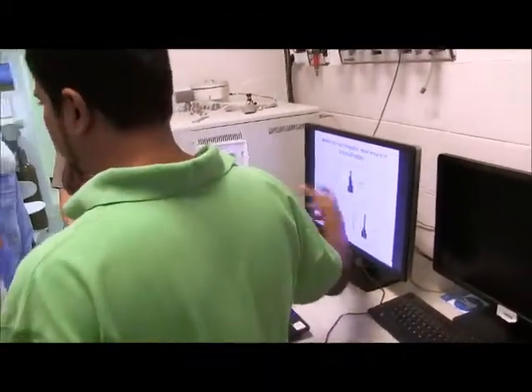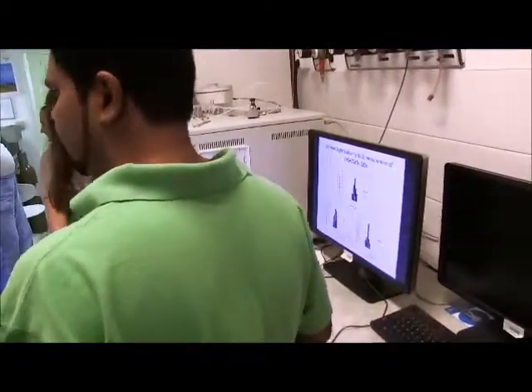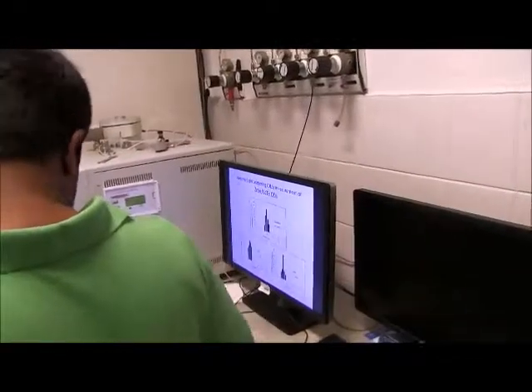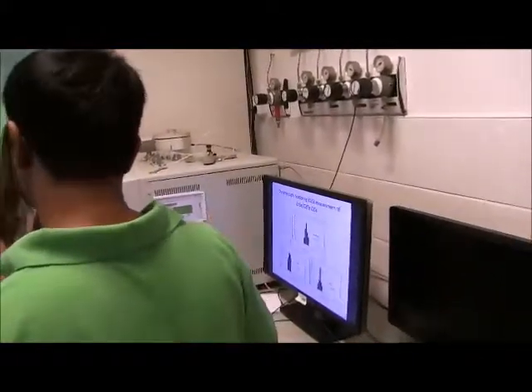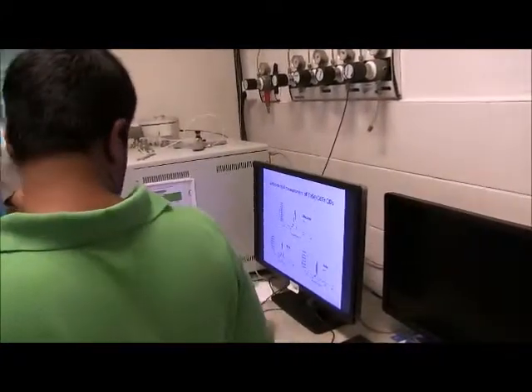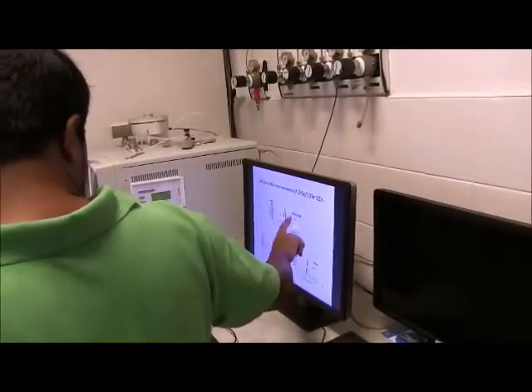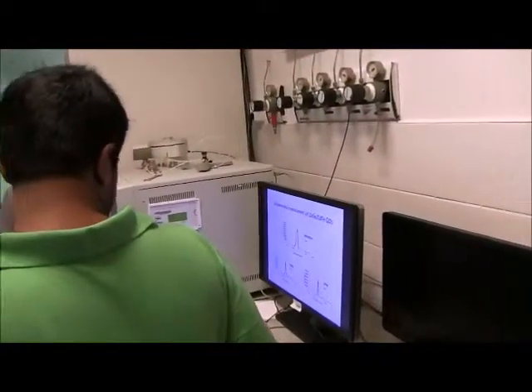This is some more characterization, like zeta sizer. We wanted to know the exact size of this particle. We found it's okay not only for imaging, and we are also using this particle for different other experiments that are going on here. This is the zeta potential, and it shows a really good zeta potential, so that it can have good affinity for other components.